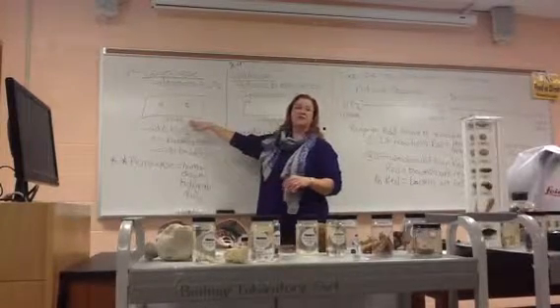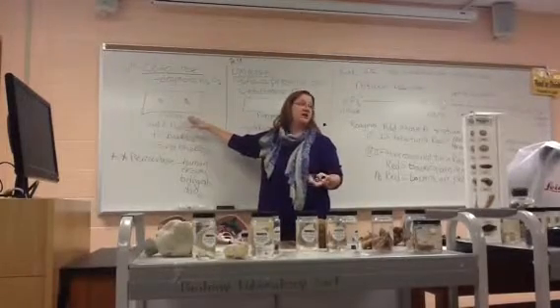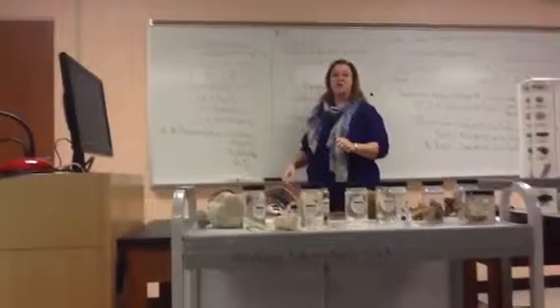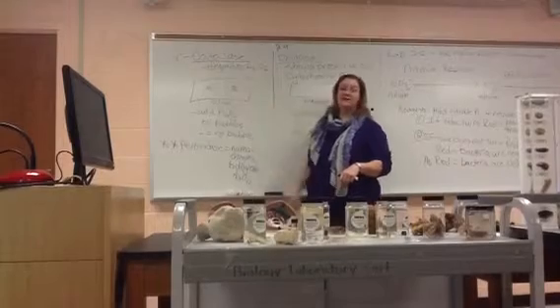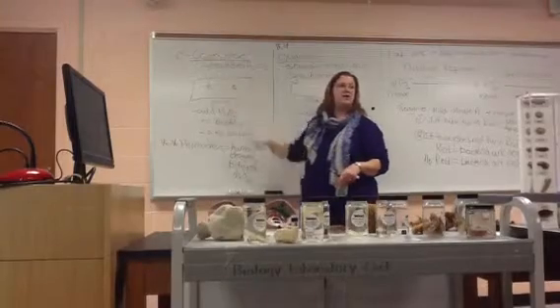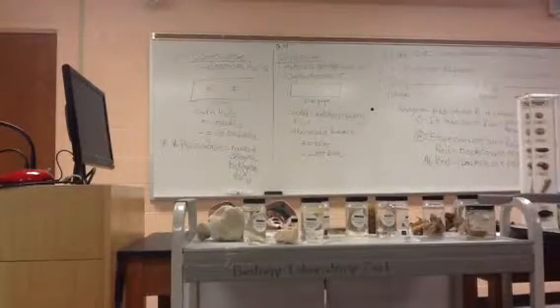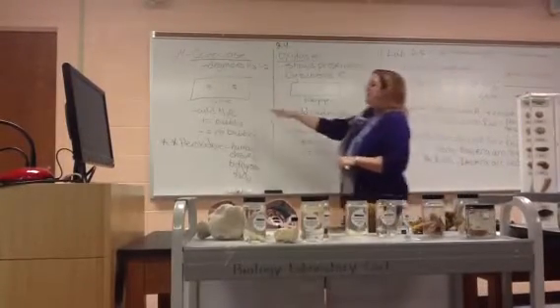Here you get a glass microscope slide. You're not looking at it under the microscope, you're just using the glass as the surface to perform the test on. Then you'll read lab 24 to see which two bacteria you're supposed to use for the catalase test. Your materials page is probably going to have like 4 bacteria listed, so read through the procedure, make sure you're using the right two for catalase, and just dry smear them onto the glass, 2 piles, whichever 2 bacteria your lab book says to use. Then get a dropper full of hydrogen peroxide. We've got the brown bottle from the pharmacy up here on the front table, some disposable pipettes. And you're just going to add a drop of peroxide to each pile of bacteria.